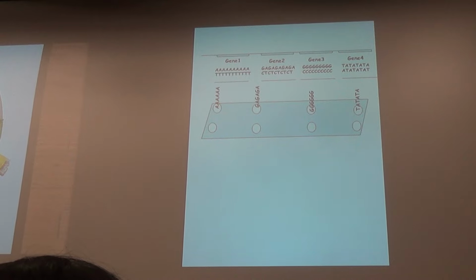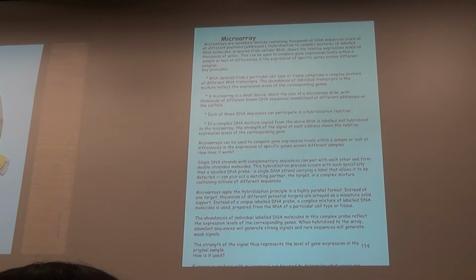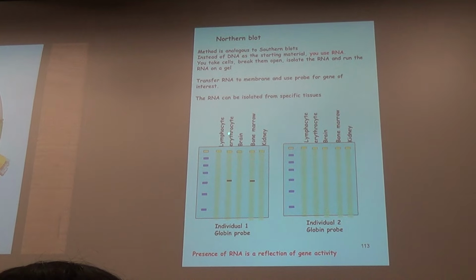Now, what did we do in the Northern blot? We basically transferred the messenger RNA onto a filter and probed it with a radioactive globin probe, correct? The messenger RNA was not labeled. The little globin gene was labeled, correct? Yes? Clear so far, right? That's what we've done here. This globin probe was labeled. The total messenger RNA was unlabeled.